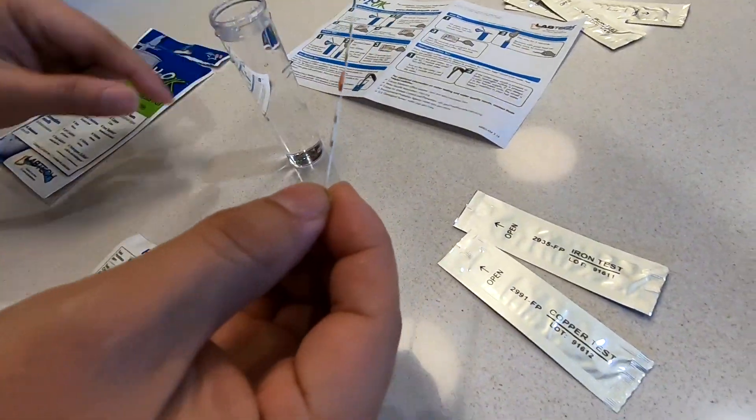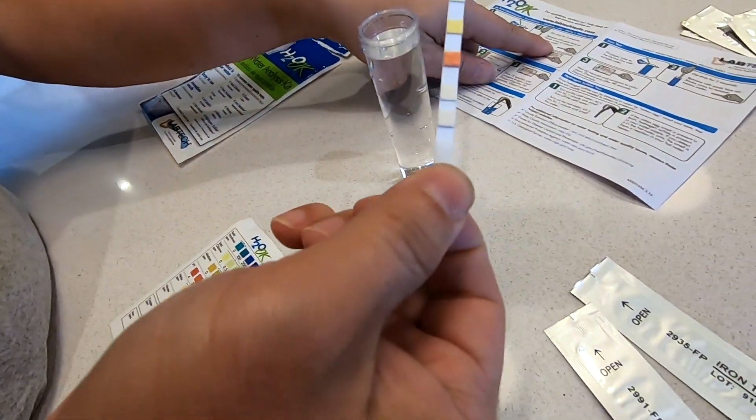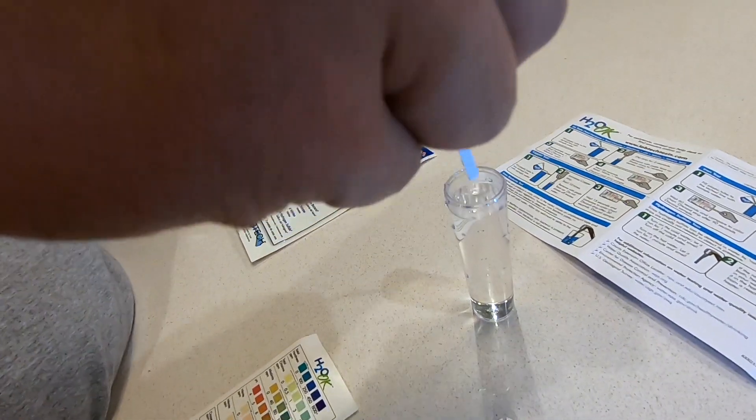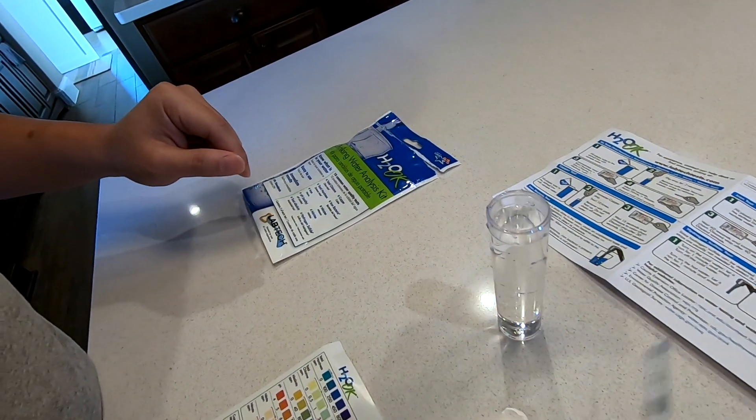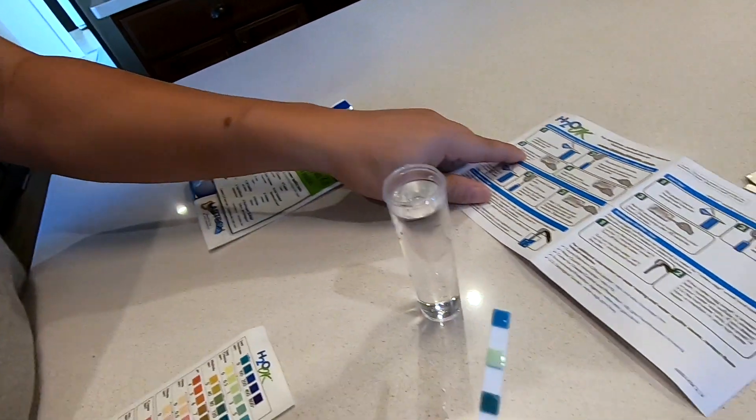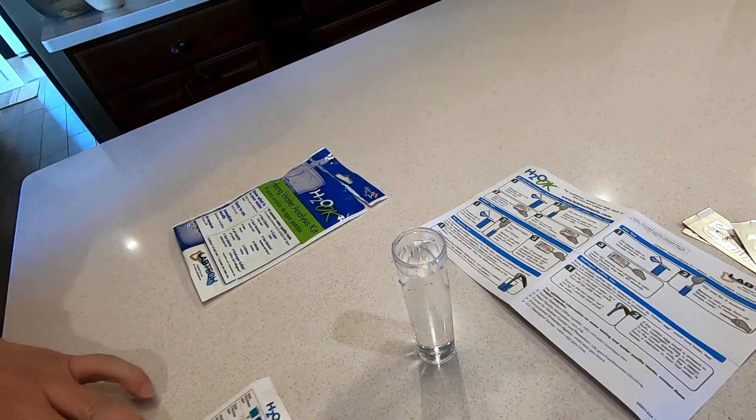It says dip for two seconds and remove with pads face up, shake once to remove excess water. So here we go. One one thousand, two one thousand, face up, shake once, and read immediately. Read for total hardness, chlorine, alkalinity, and pH.